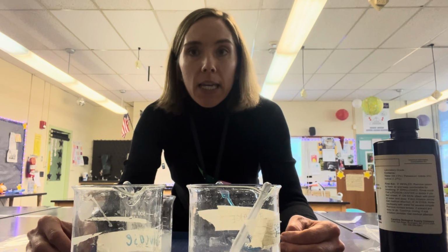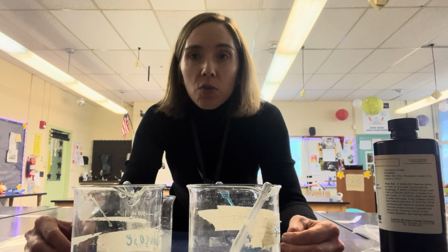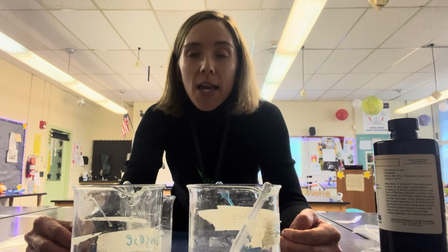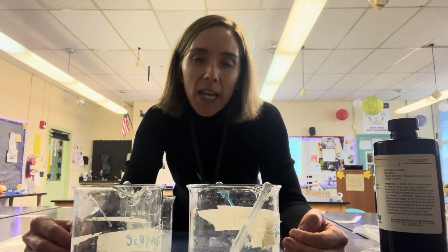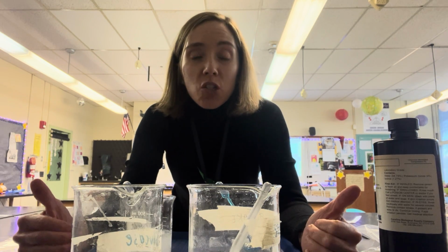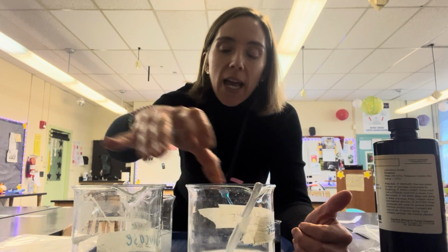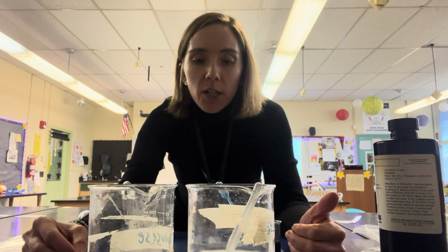So what we wanted to see is if we had glucose and starch in our small intestine, would it potentially be able to move through the walls? Because we're trying to figure out what's happening to these food molecules that seemingly disappear in the small intestine. We don't have a small intestine to use, so we're going to be using a dialysis tube, which has similar properties to the small intestine. Now, what I did is that we took the starch solution and the glucose solution, and we placed them into the dialysis tubing, tied off both ends, and put it in a beaker of water overnight.